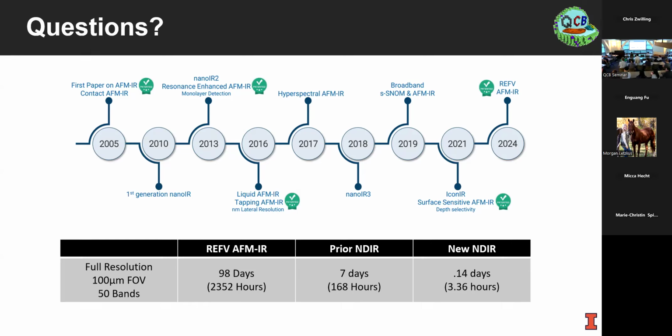The third aspect is really connecting the theory-based distortions, mixture-based things we see through AI to be able to, when the sampling volume becomes small enough, go and individually identify the metabolites within that sampling volume.